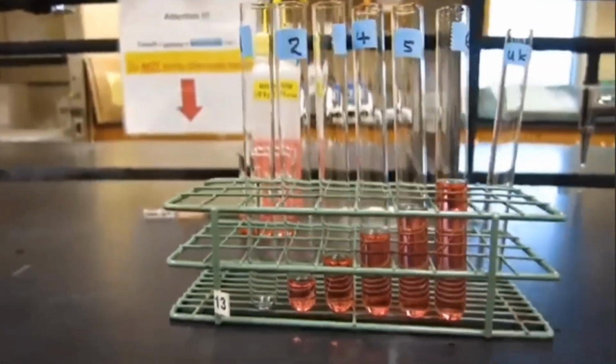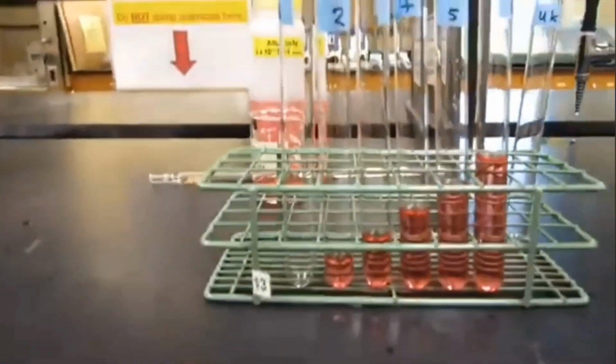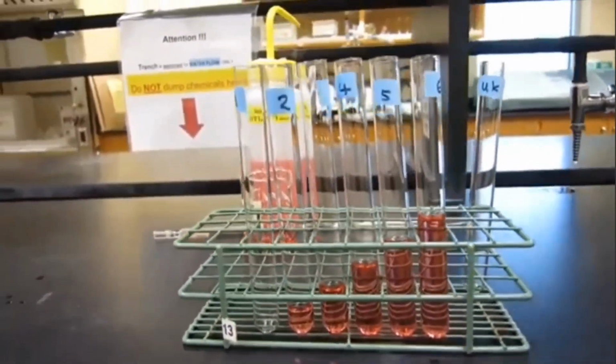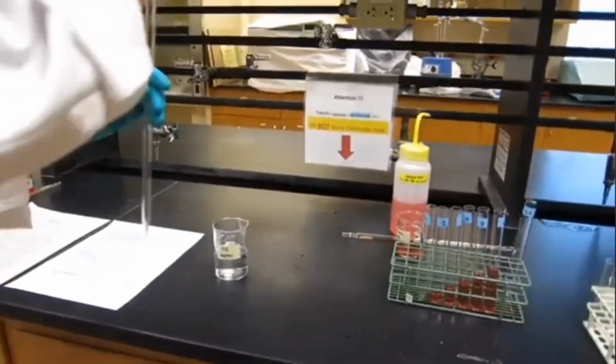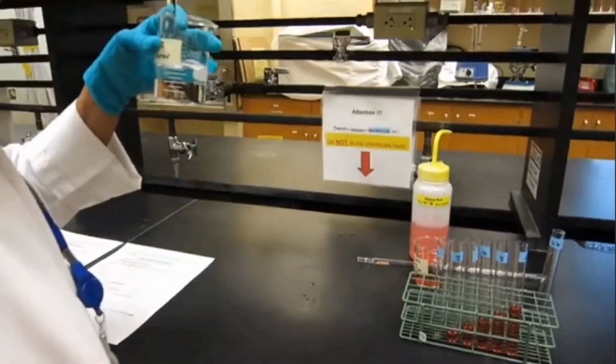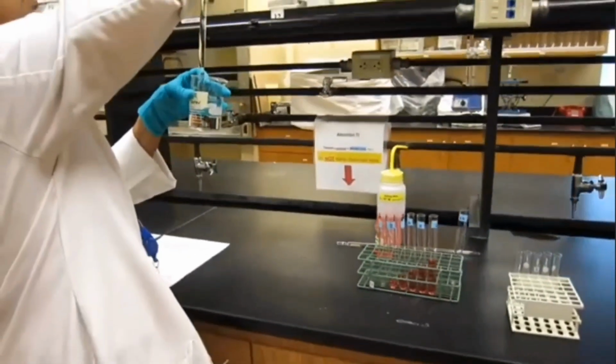Okay. And then what we're going to do, we are going to get all of the solutions to a final volume of 10 milliliters. So the first one, we didn't add any Allura red stock solution. It's only going to be water.